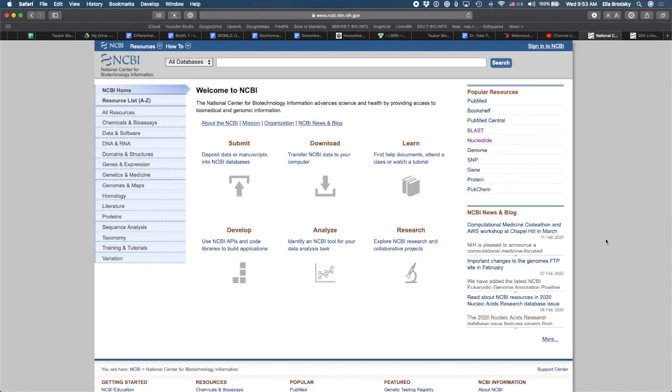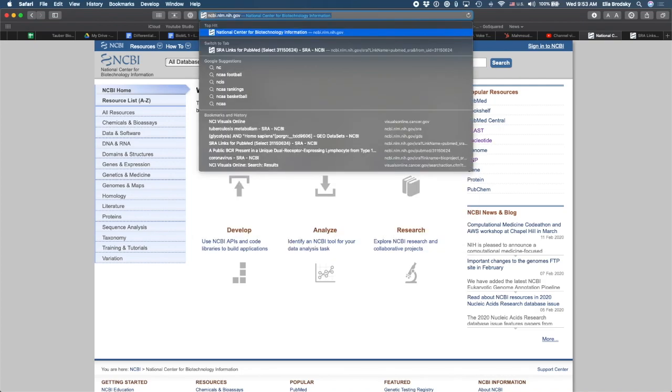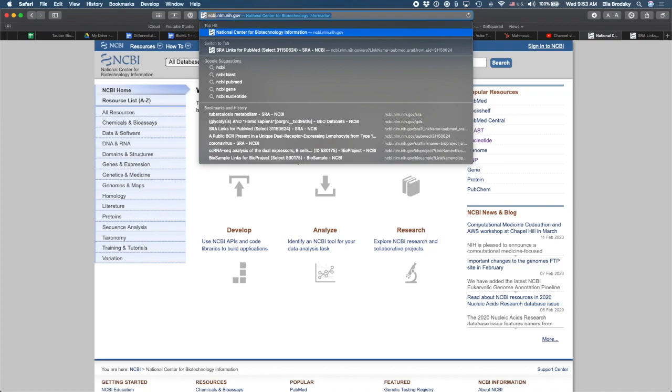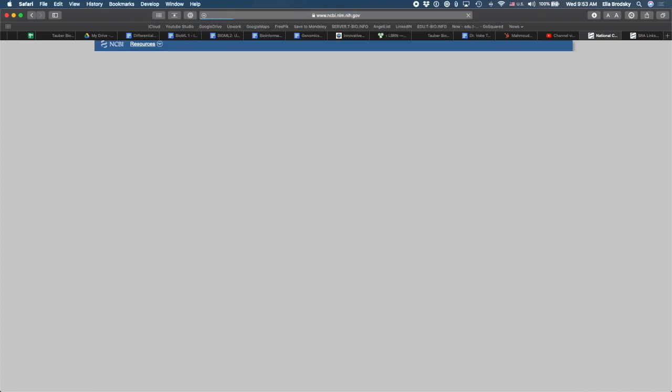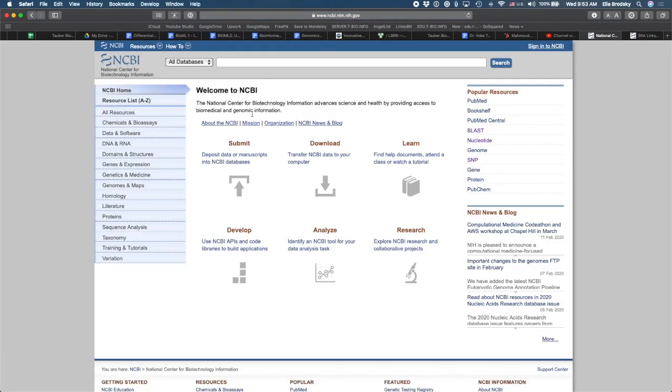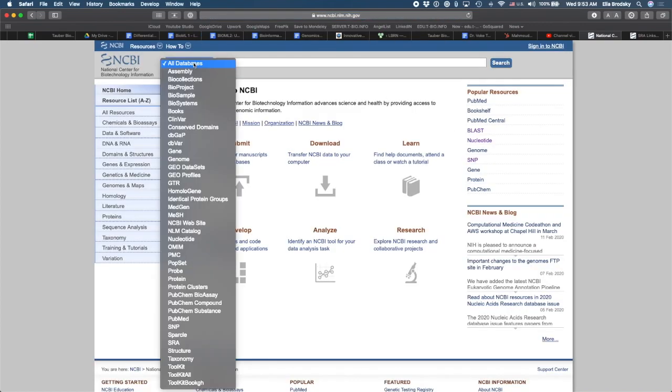So let's say I'm interested in finding some data set to work with. Let's say it's gene expression data. I'm going to go to NCBI, I can just search on Google for NCBI, and I will find this website right here. Now as you know, NCBI is the National Center for Biotechnology Information.